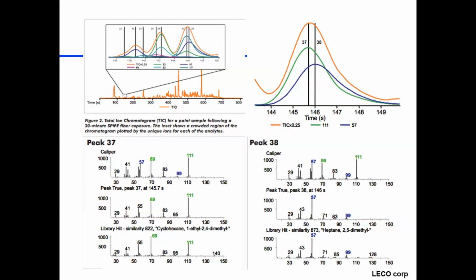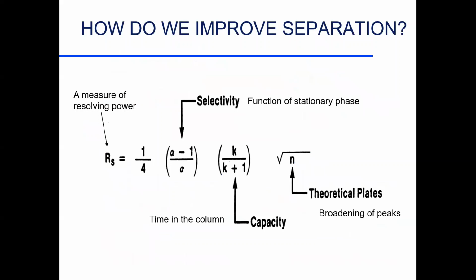You don't necessarily have to separate everything. In the world we live in, there's an awful lot of compounds around, a lot of compounds that can be coming out. Because you get a nice peak on some instrument doesn't mean it's pure. It means you got one peak. That's all it means. It doesn't mean it's pure. So the mass spectrometer has just done tremendous work at making analysis much easier and much more accurate for us. And that's within maybe the last 15 years that we've had that ability. So it's not new, but believe me, it's not old either.